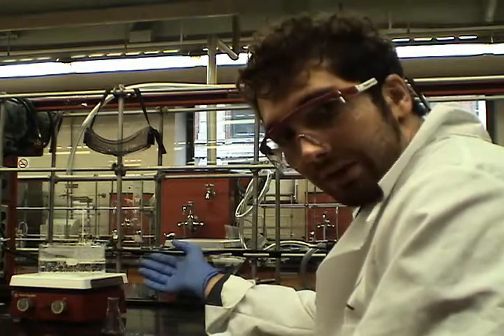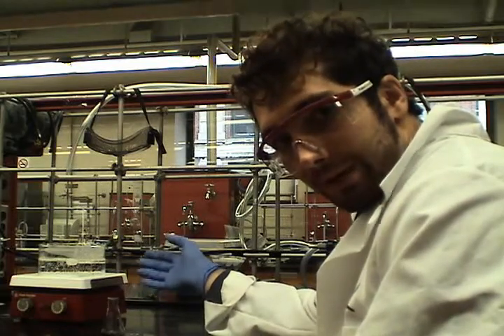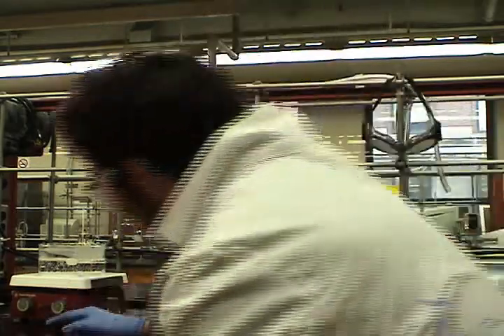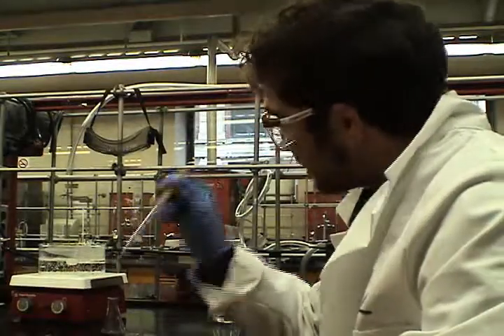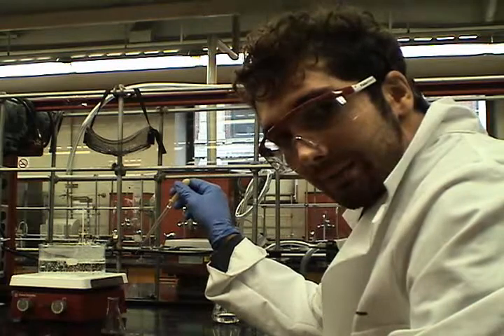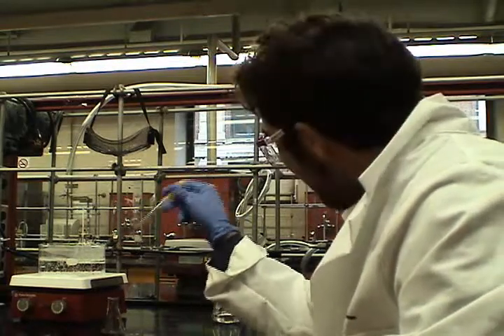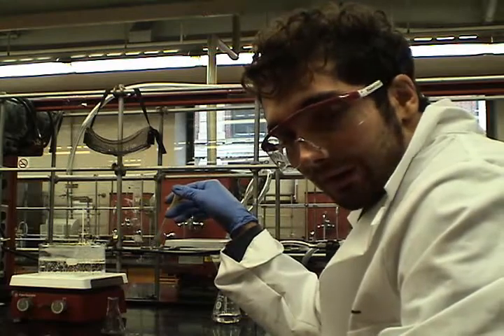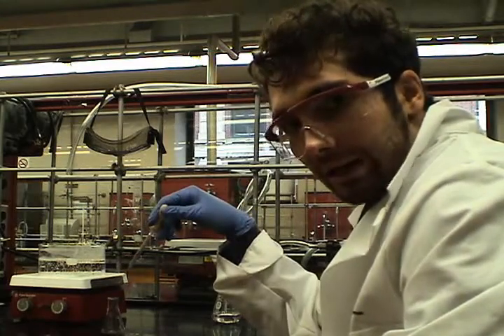Generally, this should be done in the hood, but for the purposes of making this video, I put it on the table here. What I'm going to do is use a Pasteur pipette, take out some hot ethanol, wash it into the flask, swirl it around, and then wash that onto the filter paper. Afterwards, I'll wash the filter paper again as I see necessary.